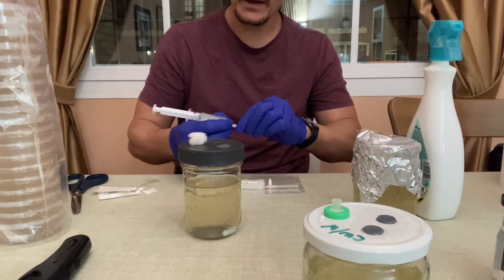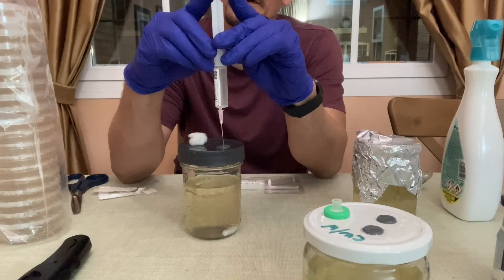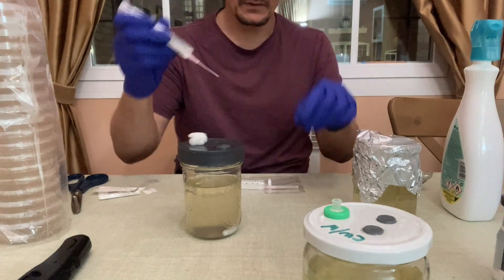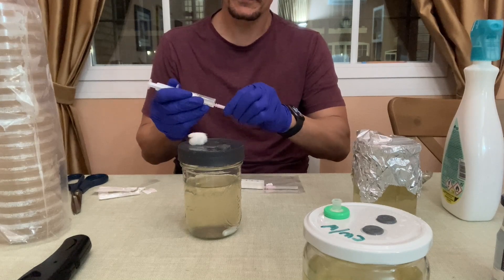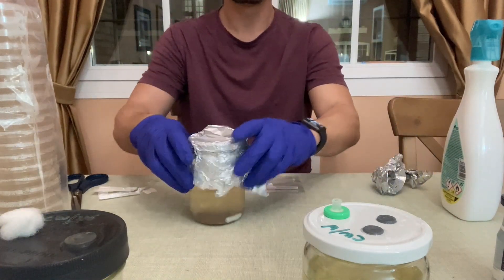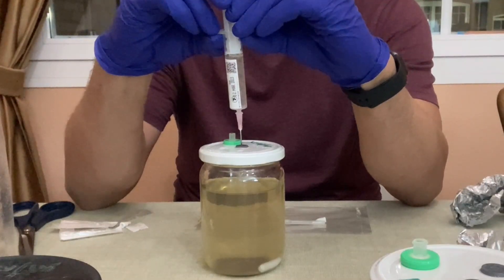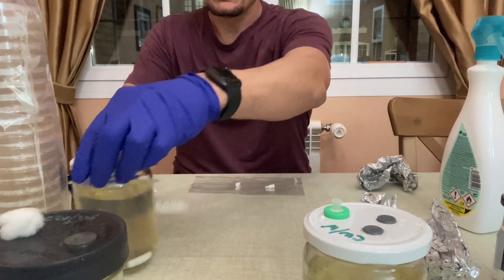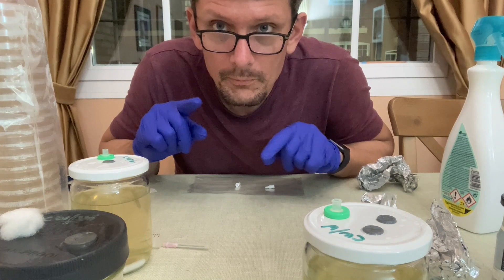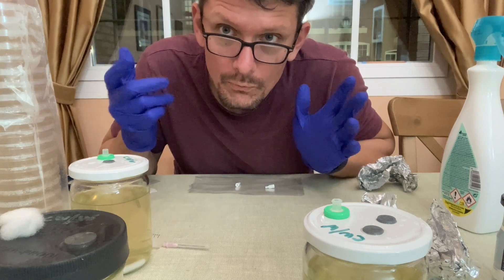This one is Stropharia rugoso-annulata. I give both the syringe and the port a spray with alcohol, shake it up, come into the self-healing injection port, and put about one to one-and-a-half milliliters of that LC in there. Cap it, set it aside, and put the syringe with it. Same process for the third strain — about one cc. I'm going to label these and let them grow at room temperature, mixing them up every couple of days once the mycelium starts to grow, so I can easily draw it up with a sterilized syringe.